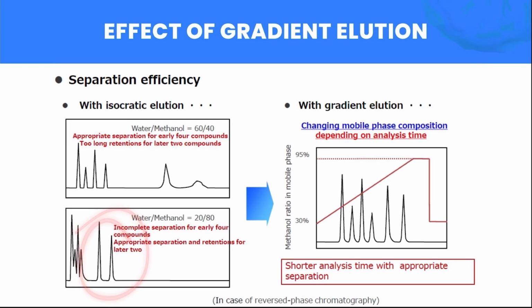These two peaks have reduced their time and have shifted to this position. But this chromatogram is also not suitable because now these peaks have merged together.